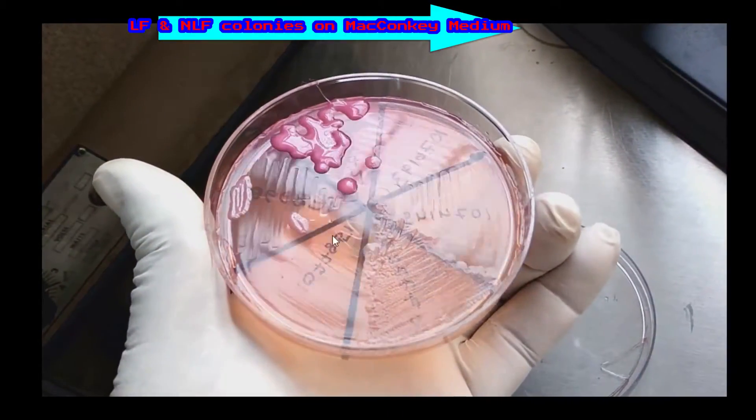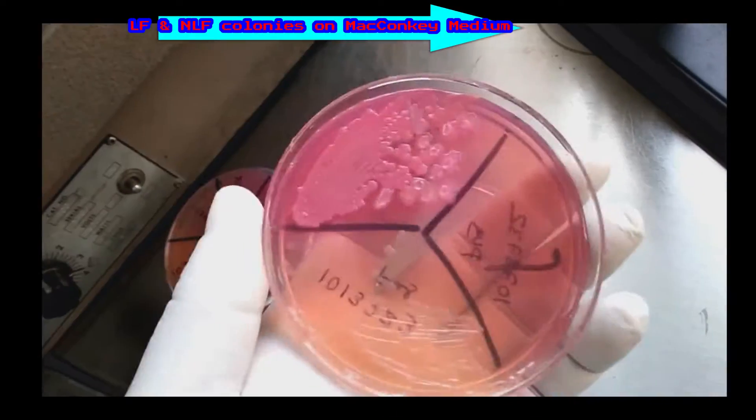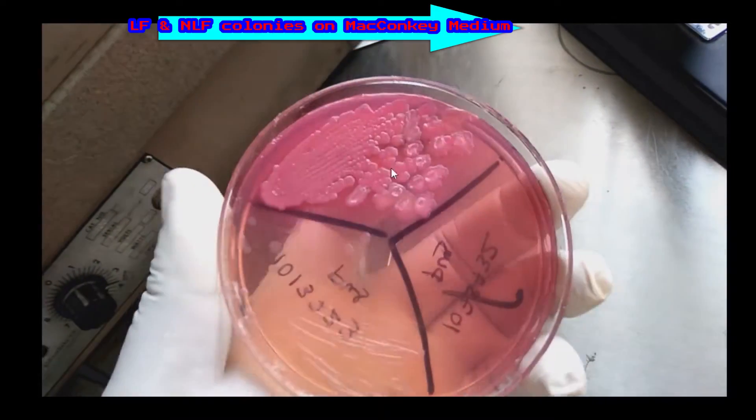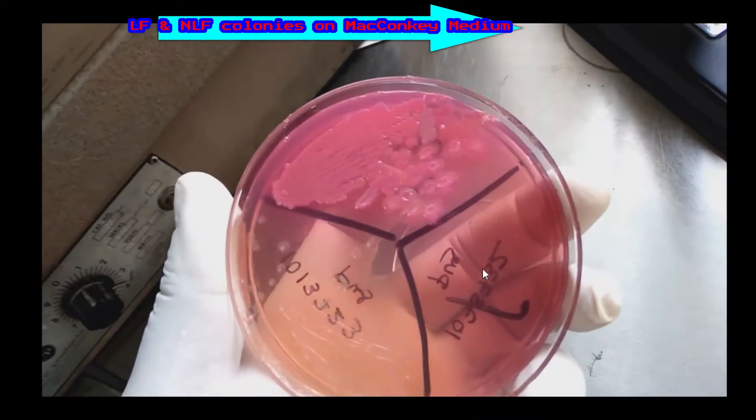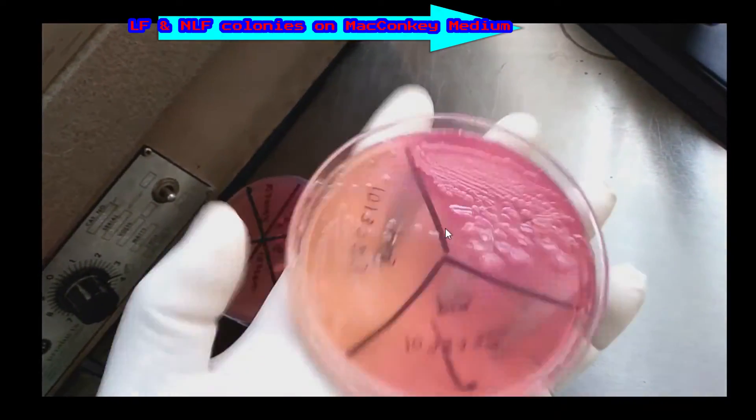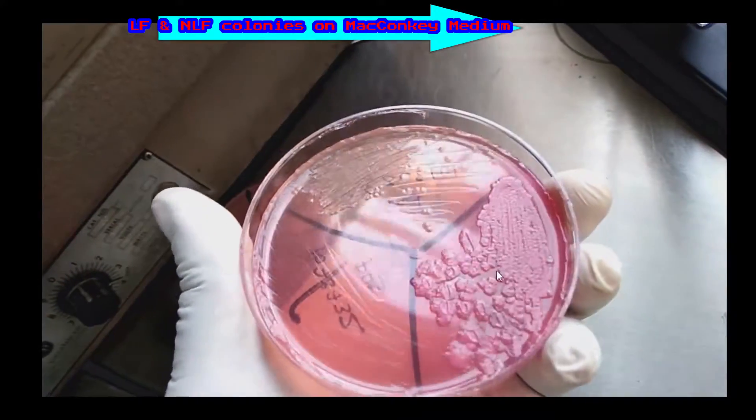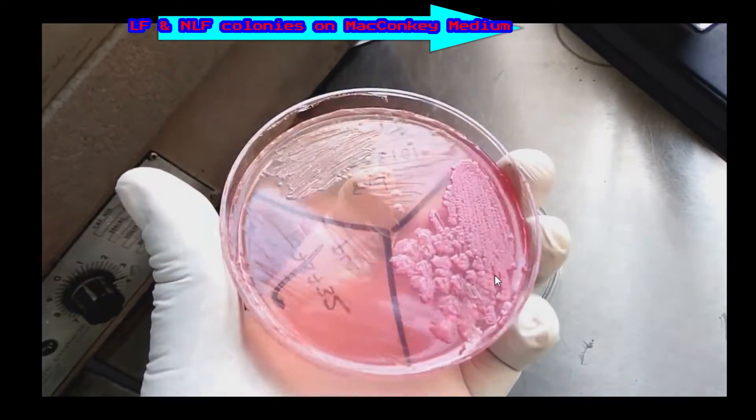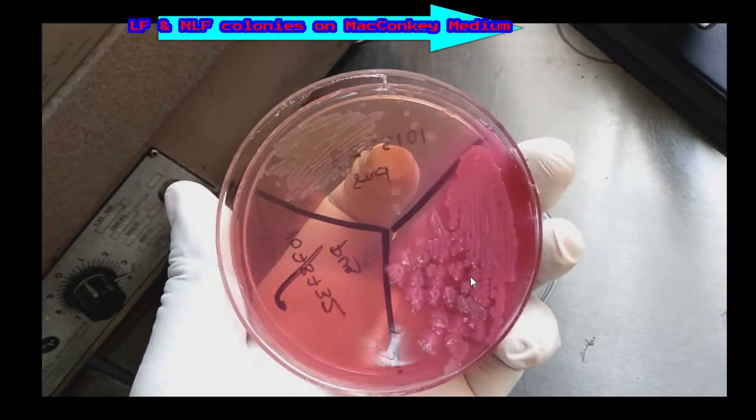Very simple. Similarly, in this plate you can also observe the pink colonies. That's why it is lactose fermenter.